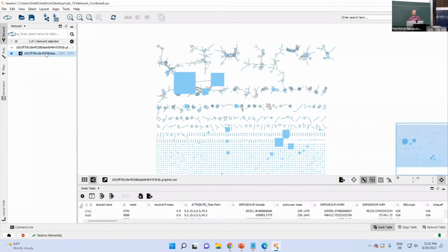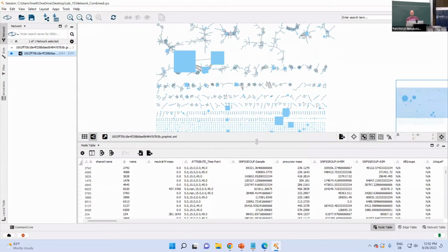So yeah, hopefully you have something like that. Whether you imported the Sirius results already or not is not so important. I think the main thing I would rely on is the library IDs anyway. So I imported this as this TSV table that you got as a summary output file. If you want, I can quickly show it again.